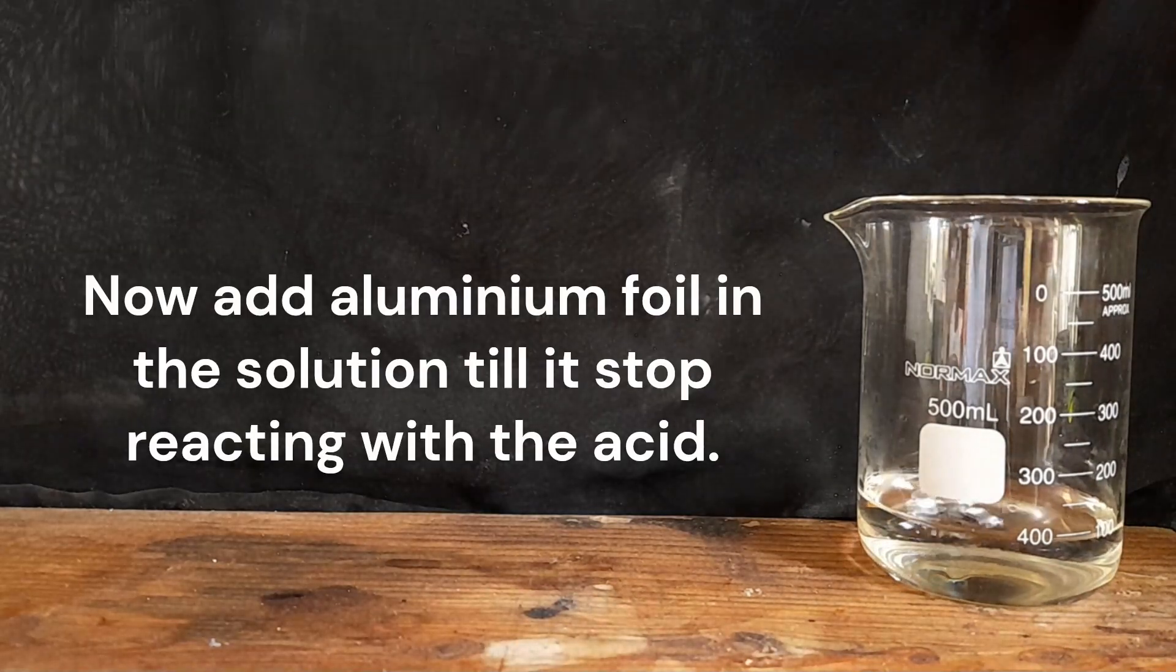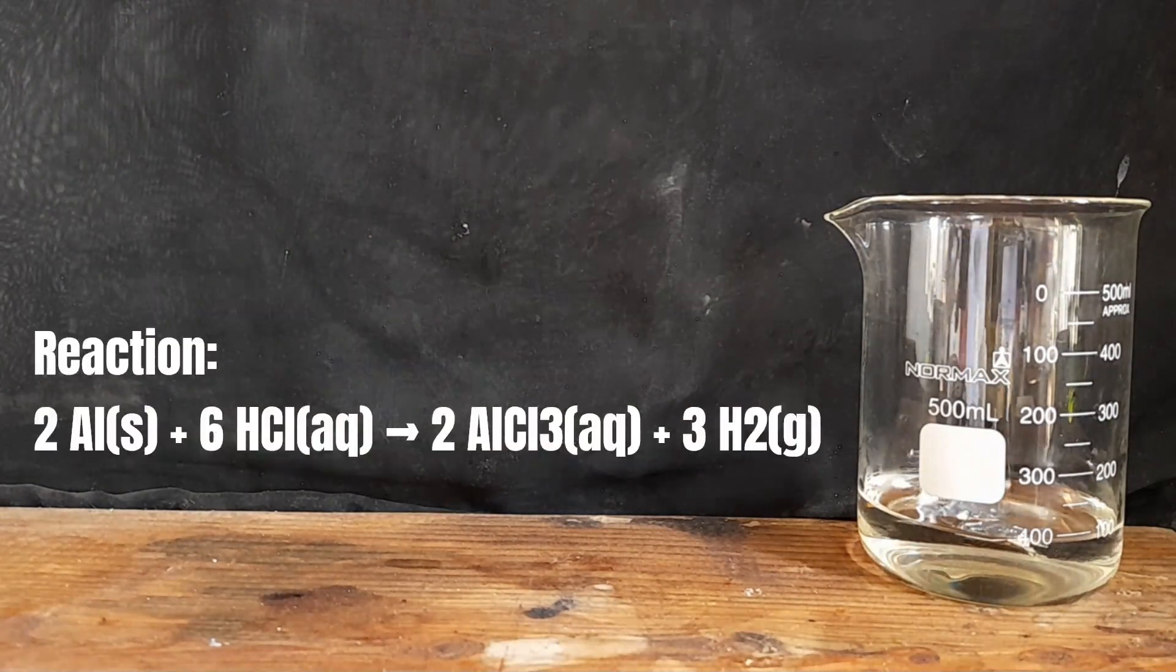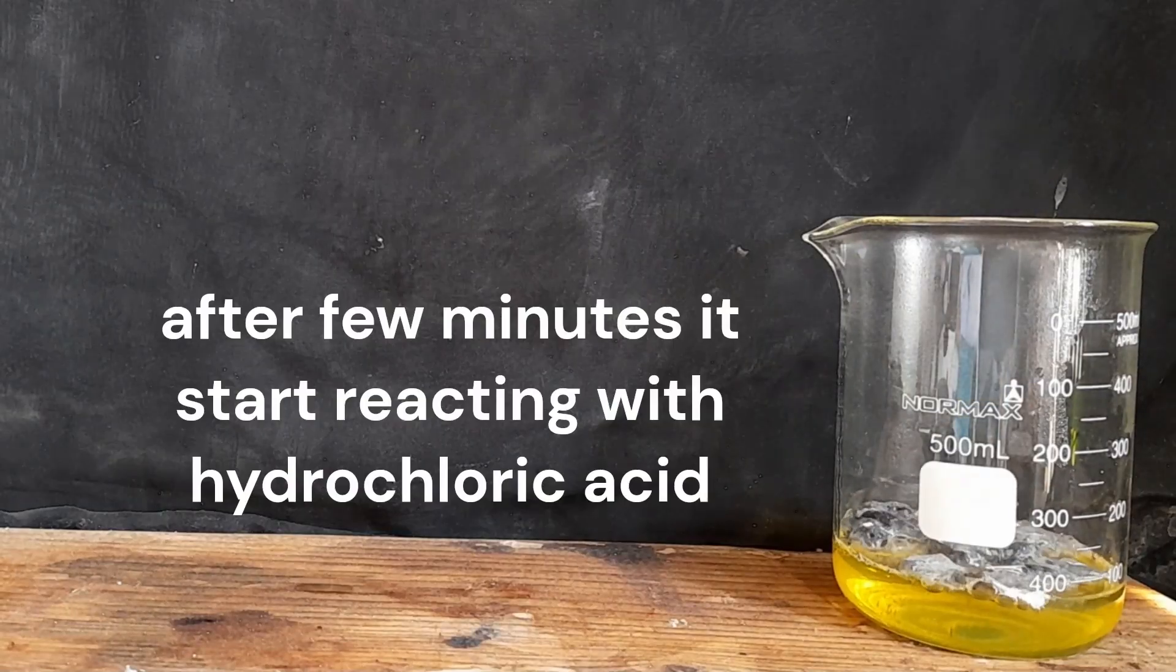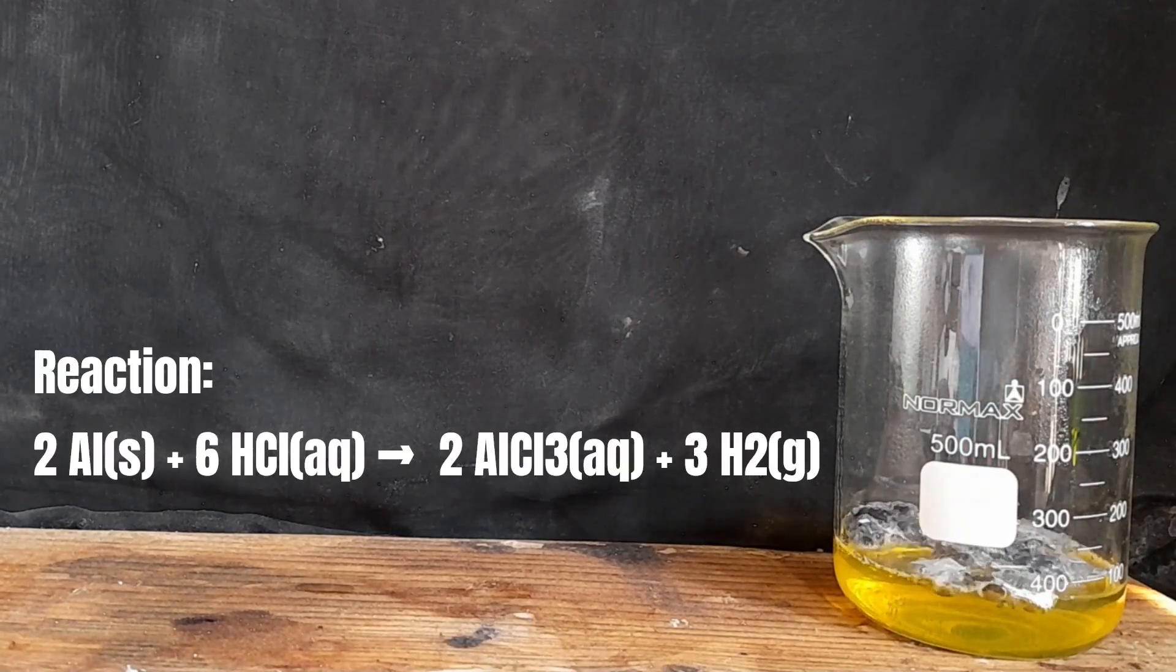Now add aluminum foil in the solution till it stop reacting with the acid. After few minutes it start reacting with hydrochloric acid.